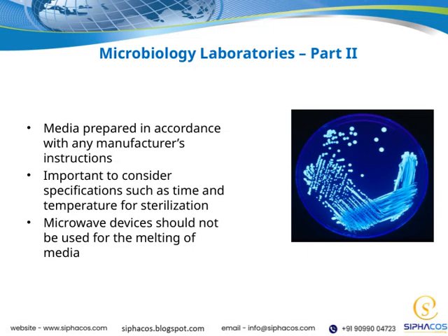Now, let's talk about preparing media properly. It's essential that all media are prepared in accordance with the manufacturer's instructions. This ensures that the media will perform as expected, providing accurate and reliable results. Another critical aspect is paying close attention to specifications, such as time and temperature, during sterilization. Proper sterilization is key to preventing contamination and ensuring the integrity of our experiments or diagnostics.